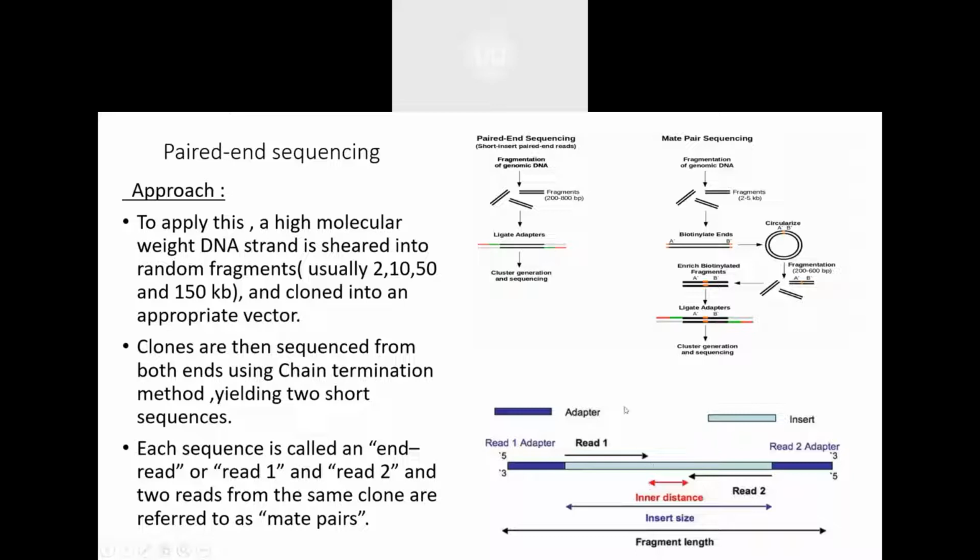Like we see in this diagram below, we have an insert and we have an adapter. This is an entire sequence and we have two reads here, read 1 and read 2, or these are called the end reads.